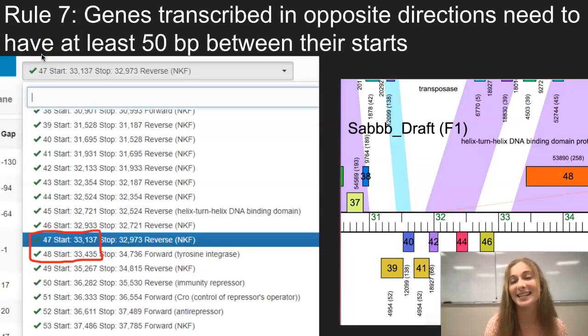Rule number 7 explains that when there is a directional change in how the gene is being transcribed, there needs to be at least a 50 base pair gap in the directional change. So on this FAMRIATOR map right here in this example, the gene is being transcribed forward and then it goes to reverse and then it goes to forward again. And there is indeed a 50 base pair gap in both of these directional changes right here.